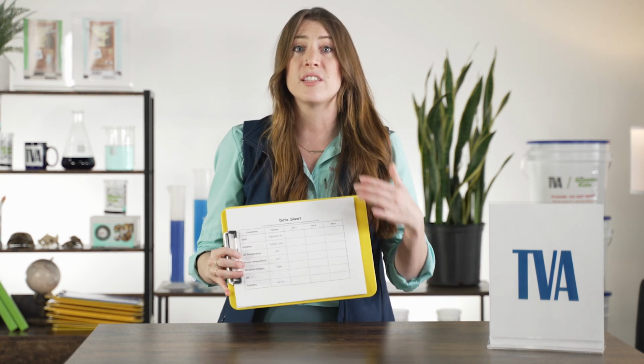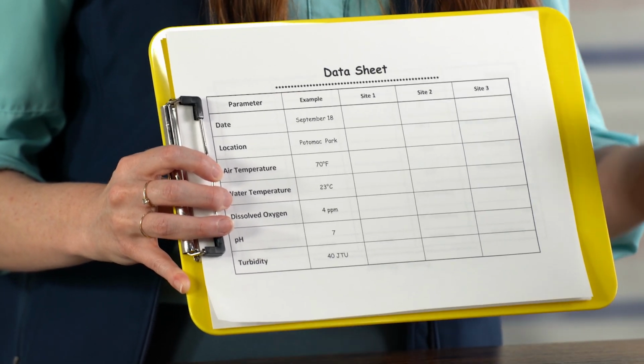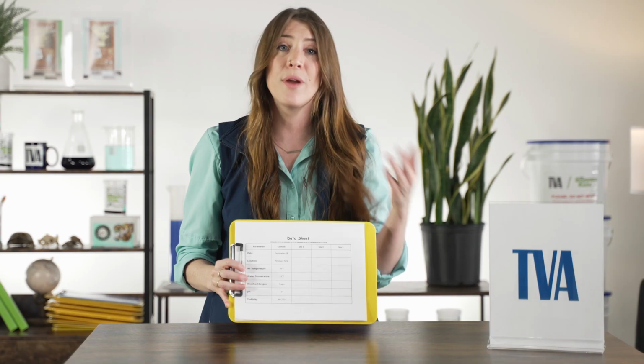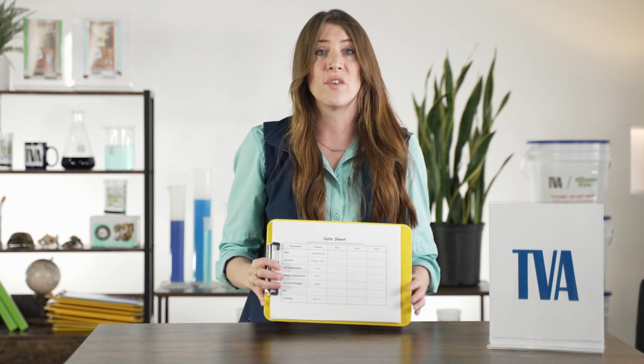Another step in the science and engineering process that we will be using is to plan and carry out our investigations. A data sheet is a document where we record pieces of information on the subject we're studying. On the far left of your data sheet, at the very top, you should see the word parameter. A parameter is a characteristic or feature that can be measured, things that often change over time.